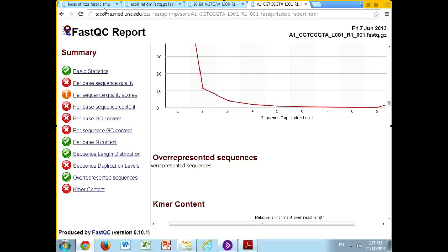So yeah, this program you can spend a lot of time just staring at little things and pondering your data.